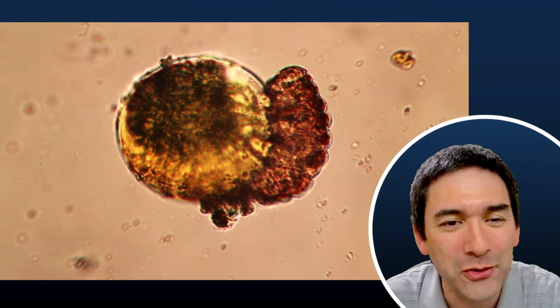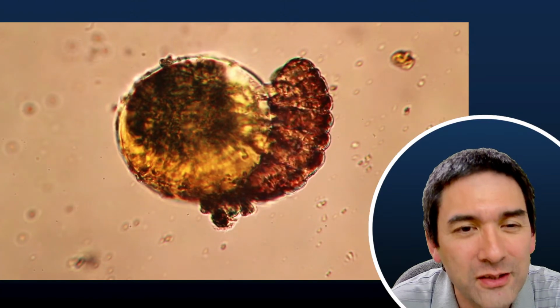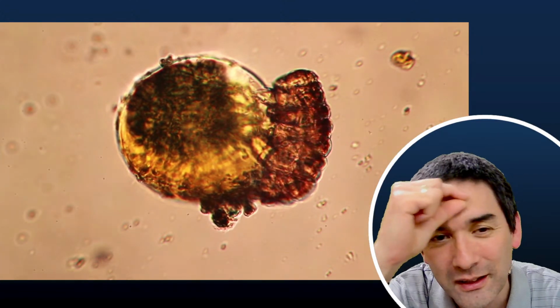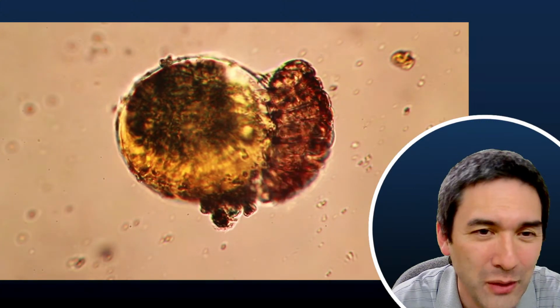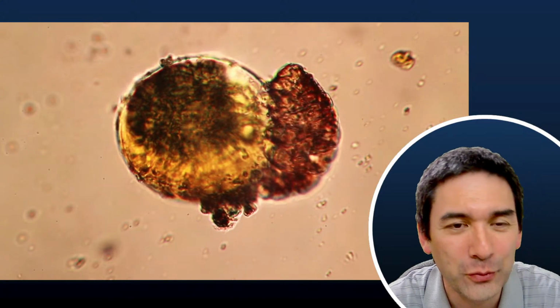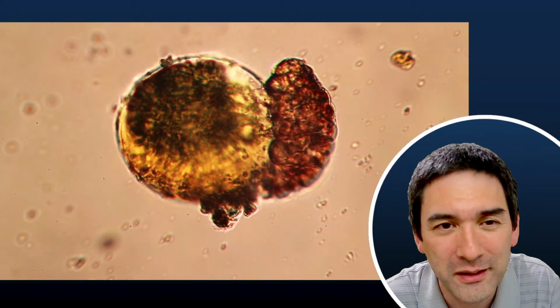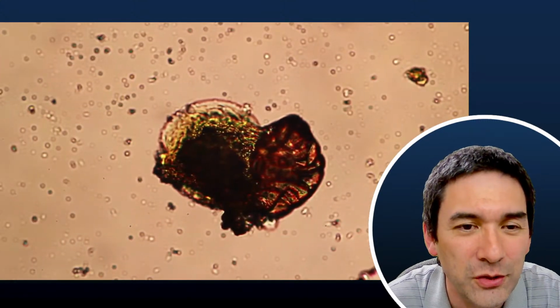I started to say before that the face mites take even more patience to find. At least if you watched my video where I put a tape over my forehead to collect my face mites, it does require even more patience. So maybe you do have to check for a couple of hours until you find one of them. But with the tardigrades, generally you shouldn't have any problems. But as you've seen now, you might spend maybe 20 or 30 minutes looking. Okay, here the video starts to repeat.